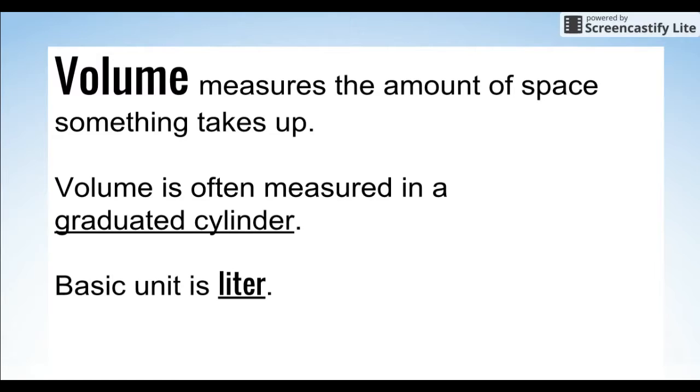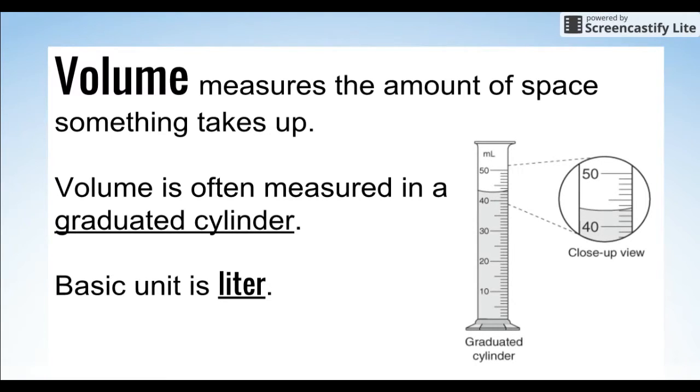The basic unit of volume is a liter. Just like the gram, liters can be broken up into larger units or smaller units using a base of 10. For example, you might measure something very tiny in milliliters or larger quantities in liters. Here's a picture of a graduated cylinder, like the ones that you'll be using later in the week.